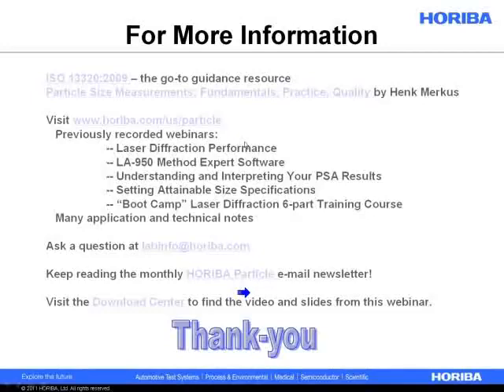I won't say that it's an errorless measurement on my part, but I feel fairly confident that if the error is that it's 0.07 weight percent and not 0.05 weight percent, the analyzer is still going to be able to pick out the difference. But I would say if there's any operator error involved there, it's got to be more significant than the instrument error.